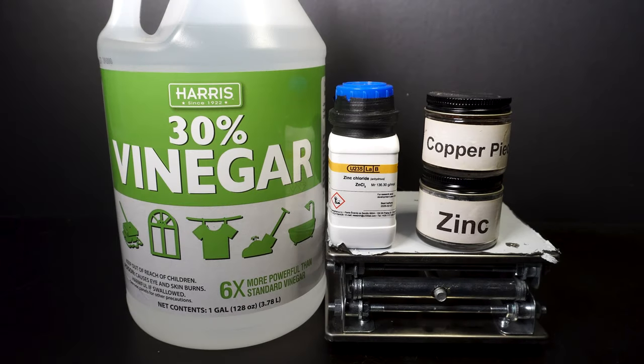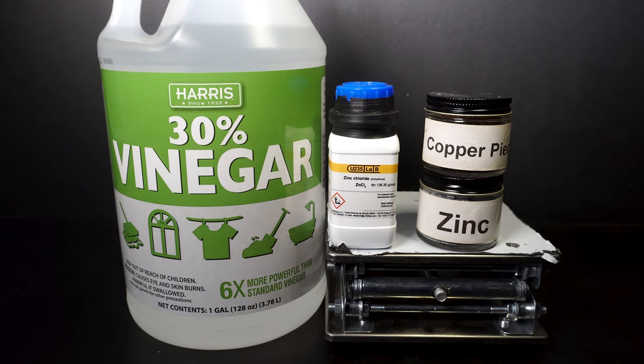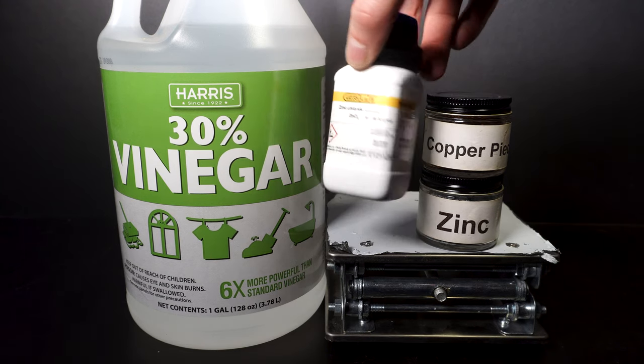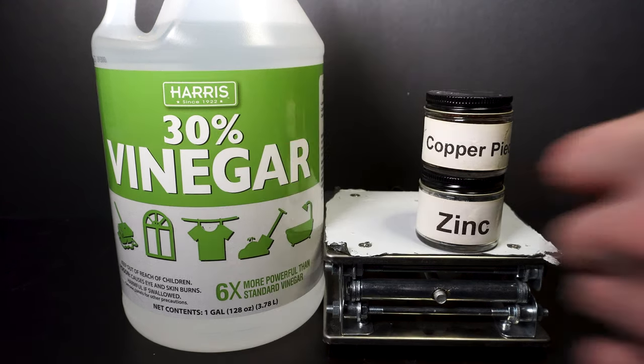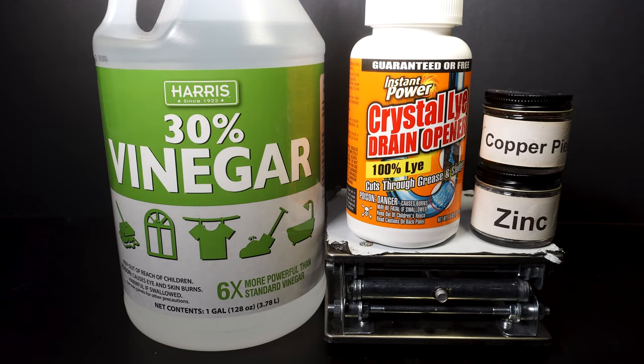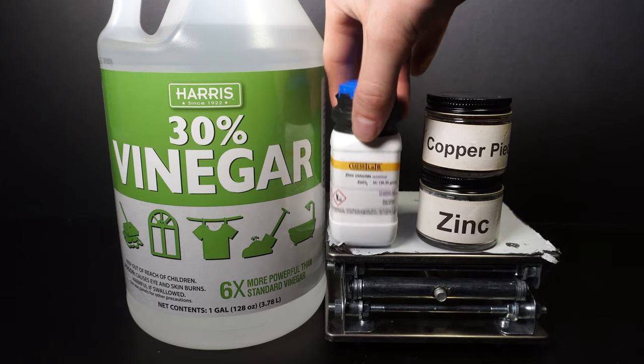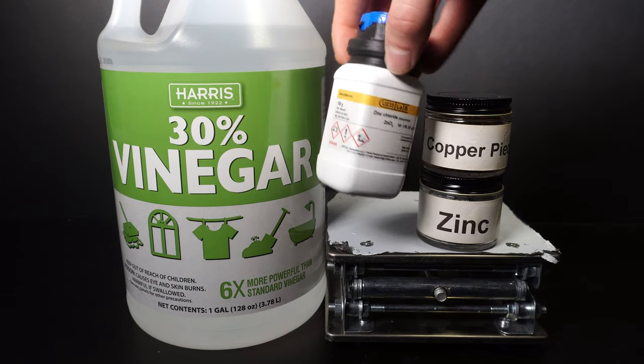The chemicals I will be using are 30% vinegar also known as acetic acid, zinc chloride, and some copper and zinc pieces. However if you don't have zinc chloride laying around you can swap it out with something like sodium hydroxide and use more zinc. Though since I do have zinc chloride I'll choose to do it this way. However I will go over the process of both in this video.